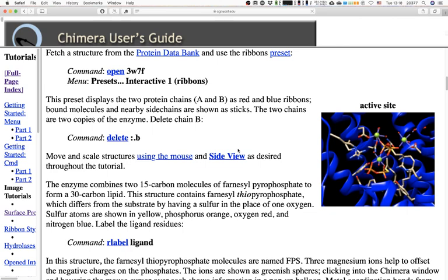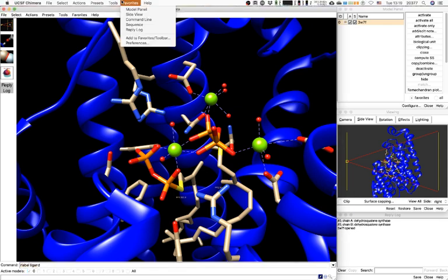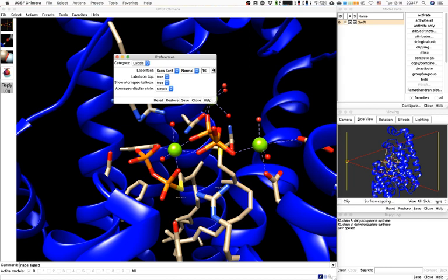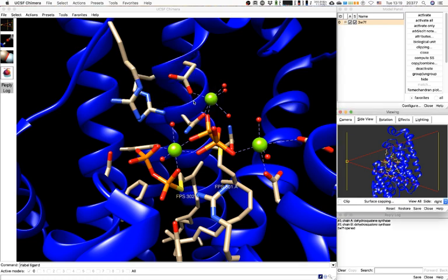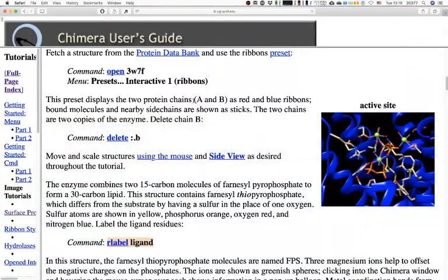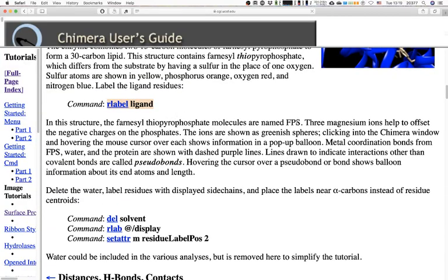We can label the ligands with the command 'rl ligand'. My labels are tiny, so I'll go to Preferences and change the font — sans serif looks better. Now the labels look nice. The farnesyl thiopyrophosphate molecules are named FPS.